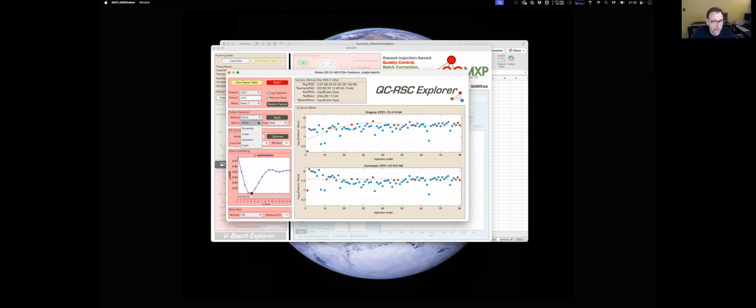When you do use outlier detection, you can then replace that data in different ways. You can replace it with missing values. You can see here it's been completely deleted. Or you can replace it with the median value of the rest of the samples, which is an option if you don't want to do any missing value imputation later on.